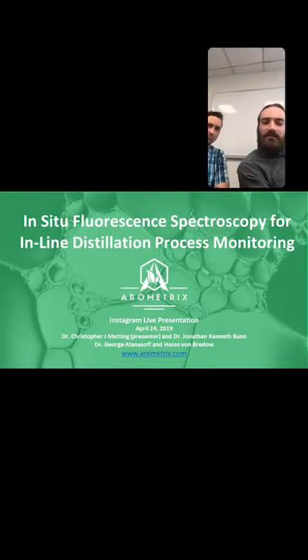What we're doing is presenting about in situ fluorescence spectroscopy for inline distillation process monitoring, explicitly for SPD today.